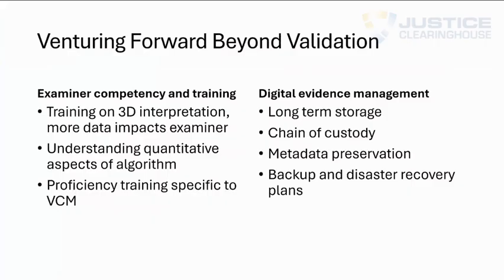When we're looking at venturing forward beyond validation, one of the things that we have to look at is examiner competency and training. And this is training on 3D interpretation, because as we embrace more 3D technology, more data will impact the examiner. It's important to understand and remember that our identification criteria is built on a data set that we have acquired using standard light comparison microscopy. When we're looking at virtual comparison microscopy, we are going to have more data, and more data can impact our criteria for identification.